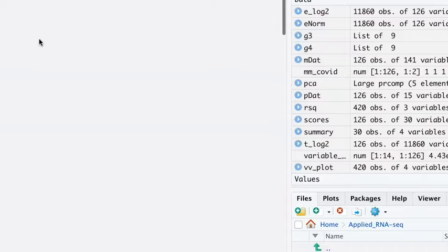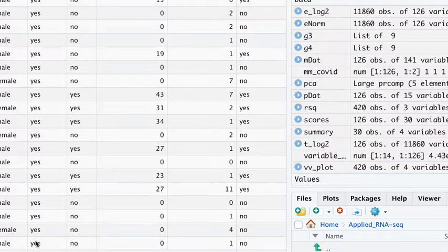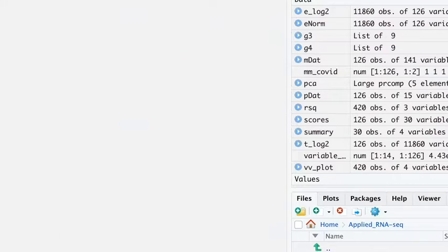So what we're saying is within our p.data frame, only take the COVID column, and the model.matrix function automatically turns the column name into a very specific one called COVIDyes, which means that if there is a 1 over here, that sample is indeed a COVID patient. If it is 0, the patient does not have COVID.